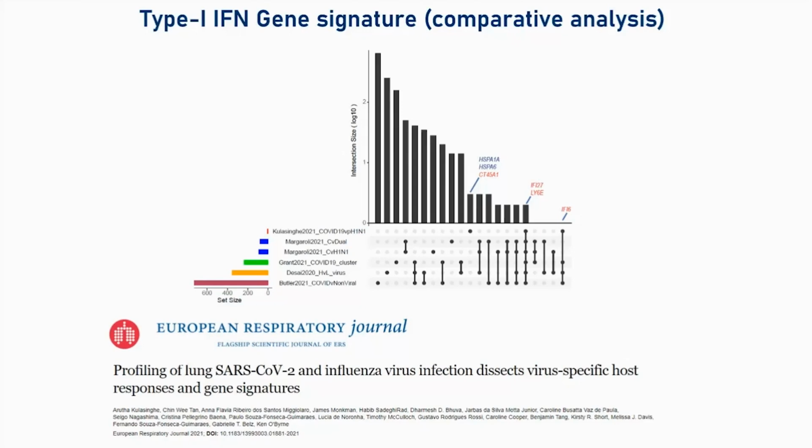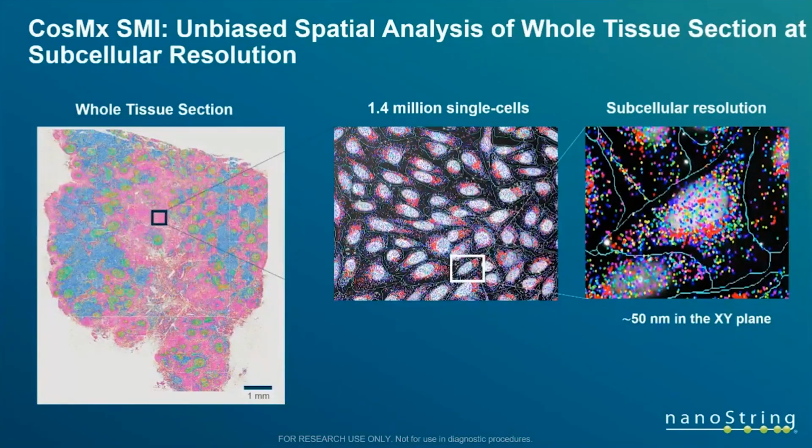and it piqued our interest. We could see this signature at a multicellular readout based on spatial, and it piqued our interest into whether we could apply this and understand where the signal was coming from at a single cell level. Can we identify the cell type, where the cells are, where the signal is coming from, this type 1 interferon?